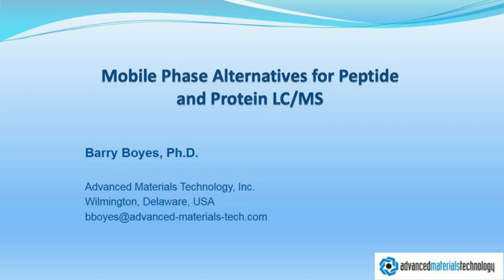We are able to dissociate some of the DFA using formic acid, and hopefully within the near future we'll be able to supply some quantitative statements around that. But generically at this point I can say yes, it's a useful thing to give a go, if for no other reason than to manipulate the selectivity of your separation.